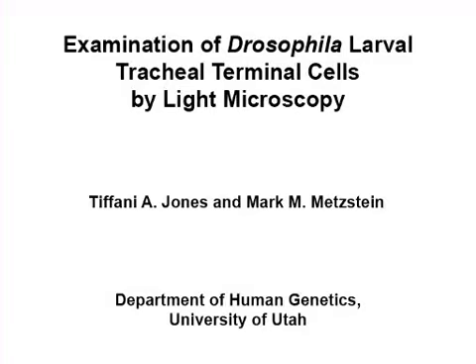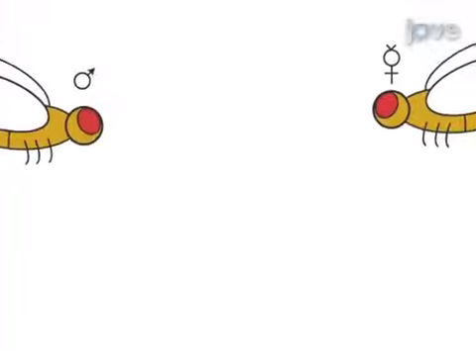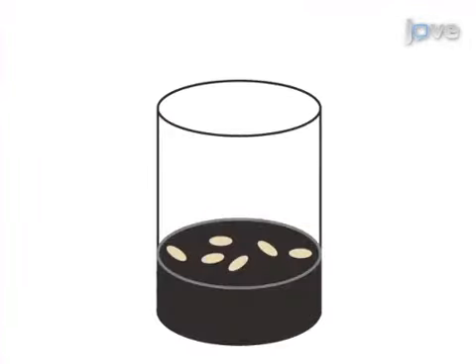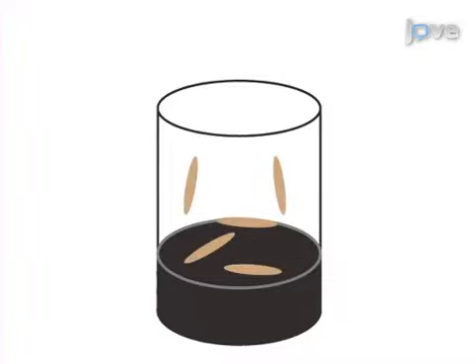The overall goal of this procedure is to rapidly fix intact Drosophila larvae in order to image the morphology of branches and tubes in tracheal terminal cells. This is accomplished by first generating homozygous fluorescent protein-labeled terminal cells in genetically mosaic animals.